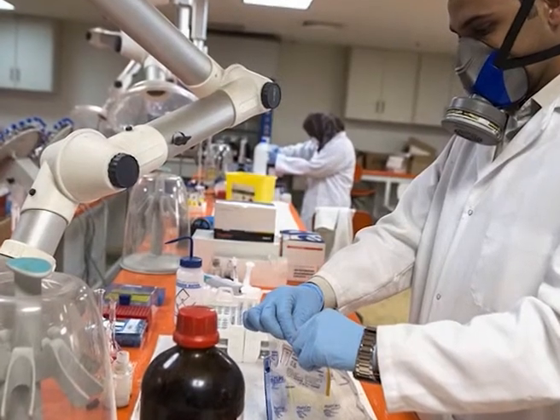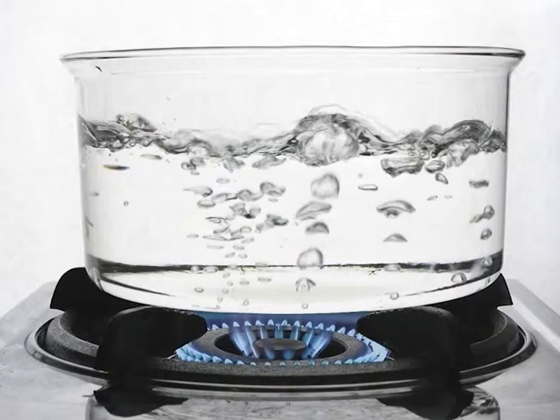Others have shifted to microwave ovens for heating and steaming. In the absence of these equipments, the object may be waved over a flask containing boiling water. In either case, heating has to be carried out in a humid atmosphere. Optimum development of fingerprints occurs at a relative humidity of 65 to 80%. Modern fingerprint laboratories are endowed with Ninhydrin acceleration chambers.